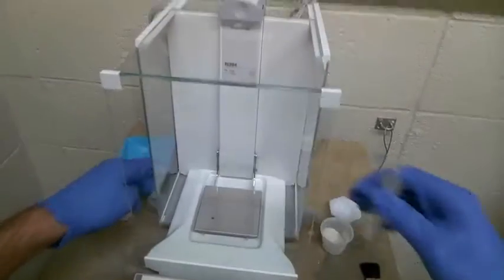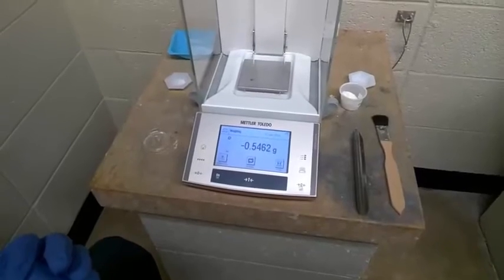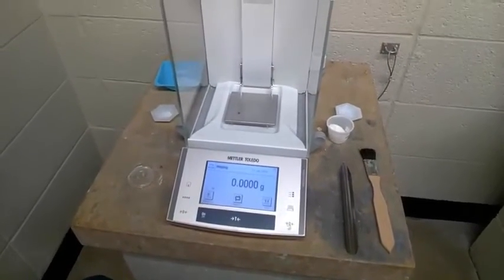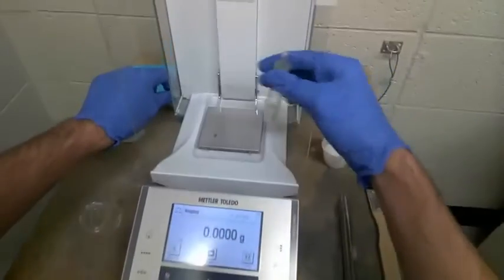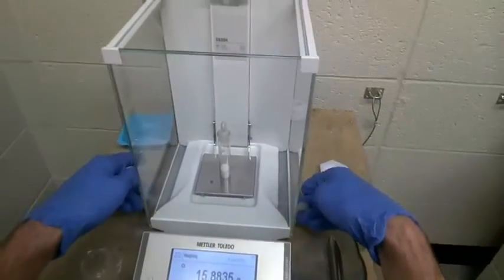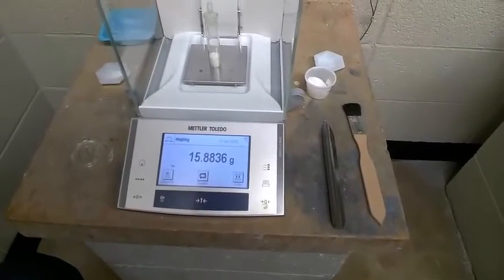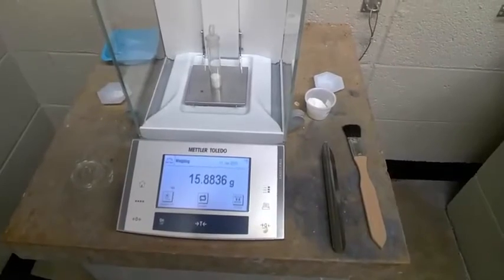The method we use with weighing by difference is we take everything off the balance and we'll tare it to zero. What we want to know is how much mass is in both the weigh bottle and the material we have available. Here we see it's about 15.9 grams.